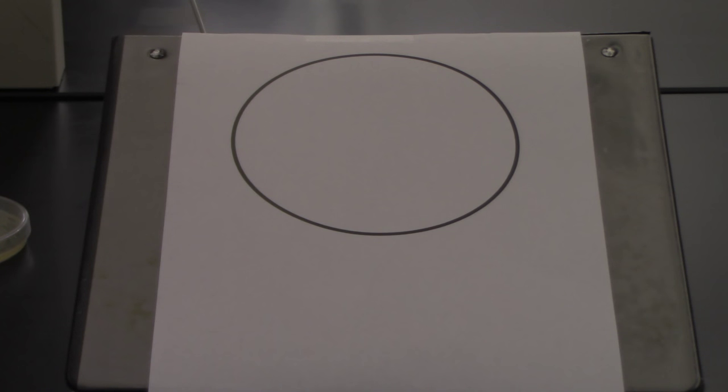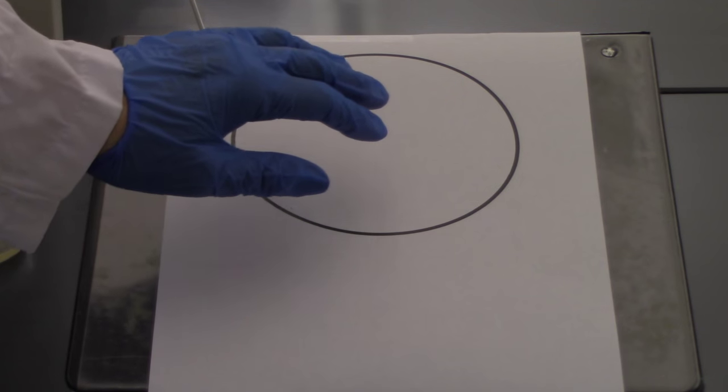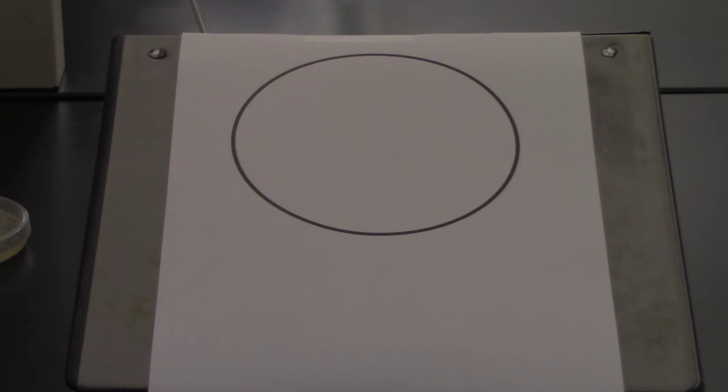This video outlines how to do a streak isolation. The goal of a streak isolation is to take a culture and spread it out, thin it out, such that you're going to have just a few nice spread out, easy-to-pick-up colonies on a petri plate.